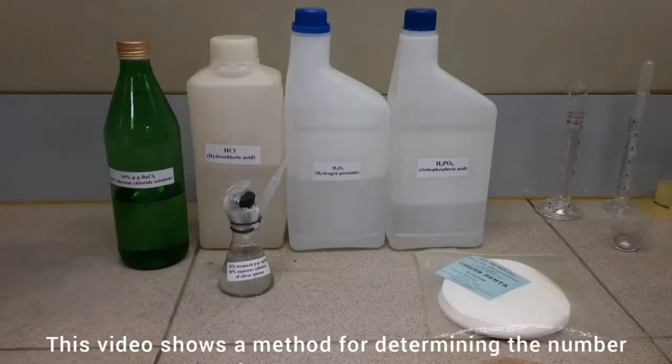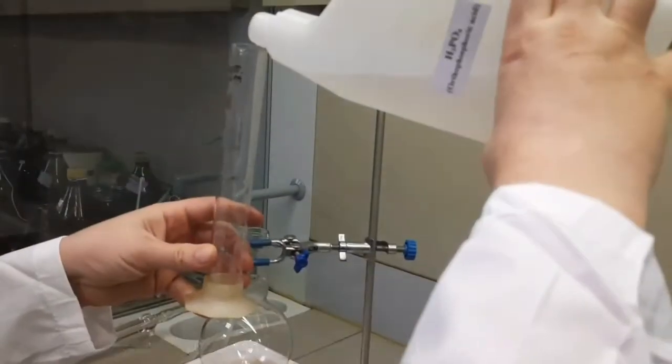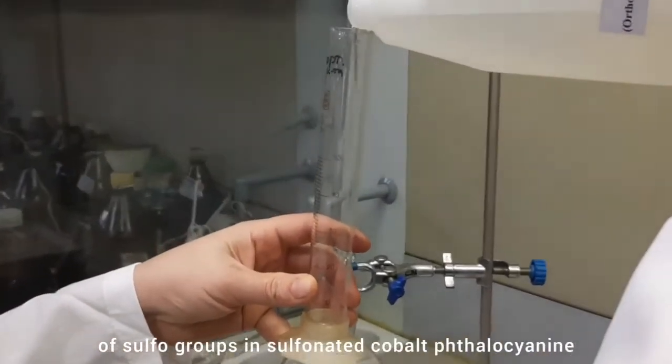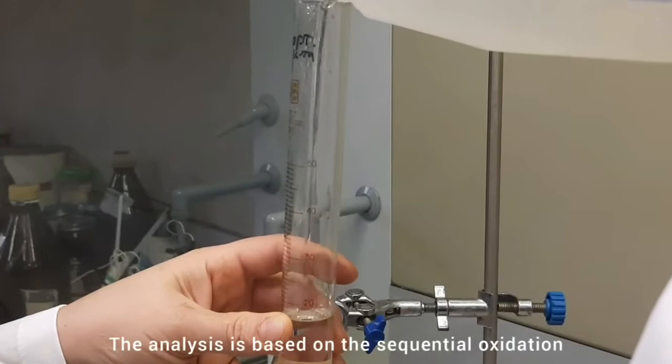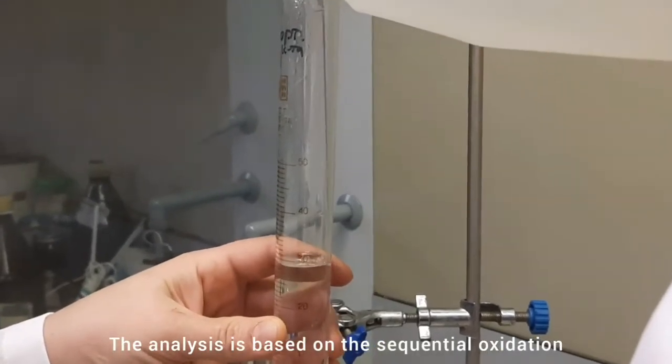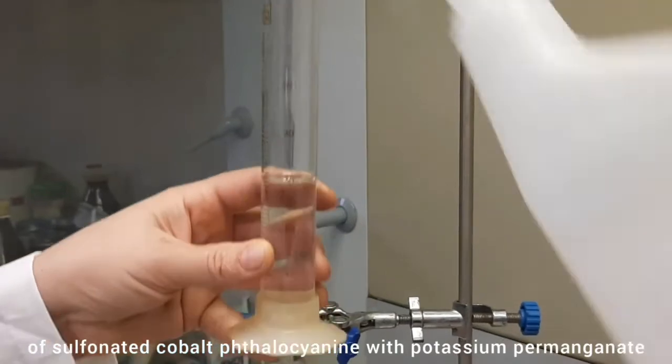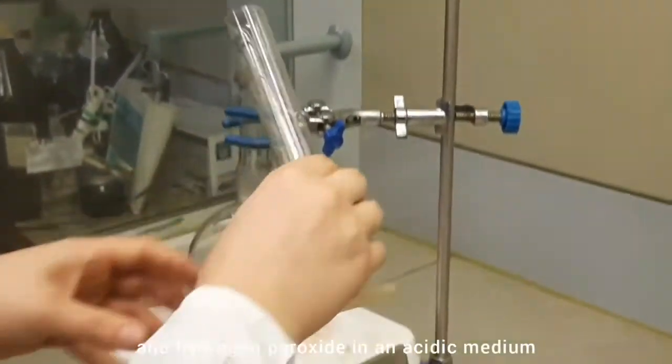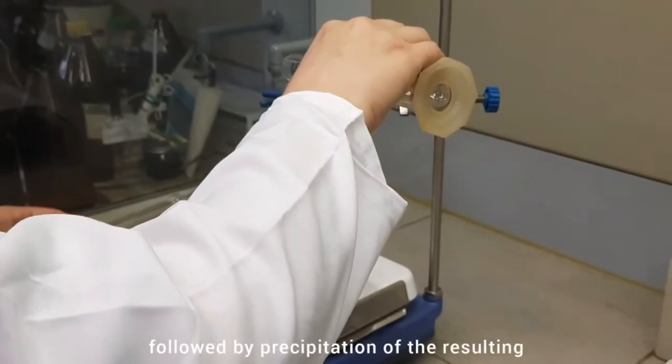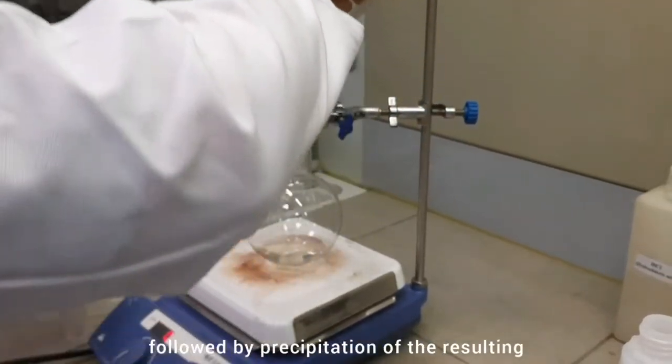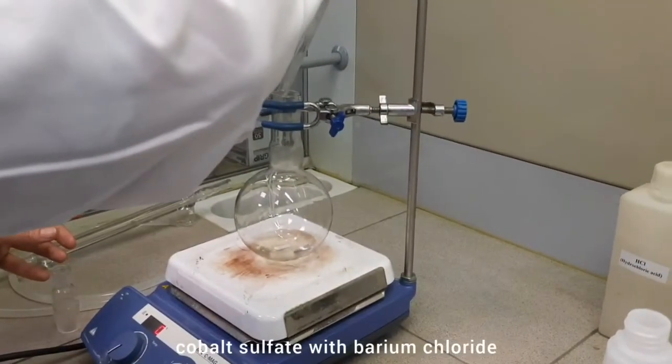This video shows the method for determining the number of sulfa groups in sulfonated cobalt phthalocyanine. The analysis is based on the sequential oxidation of sulfonated cobalt phthalocyanine with potassium permanganate and hydrogen peroxide in an acidic medium.